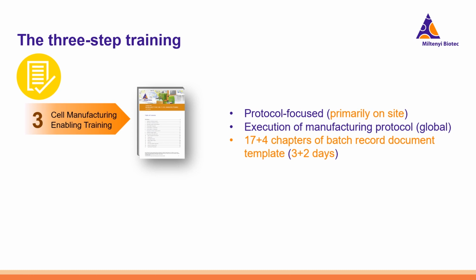But then finally, they also need to be able to demonstrate that they can run something called the unguided run, meaning that they are capable of running the protocol without being prompted by anyone. And I like to compare this a little bit to learning how to drive a car. So in the beginning, you of course just need to know how you switch the car off and on, where the trunk is, where the different parts are, the basic maintenance.